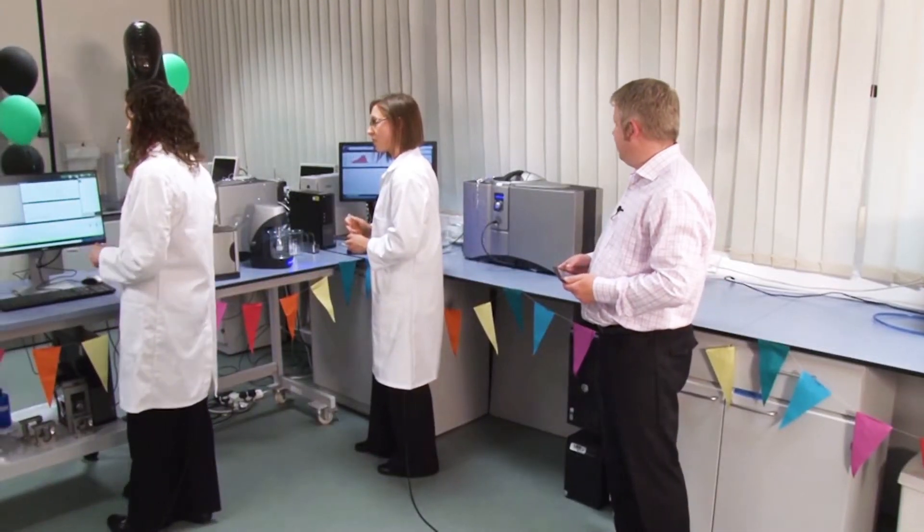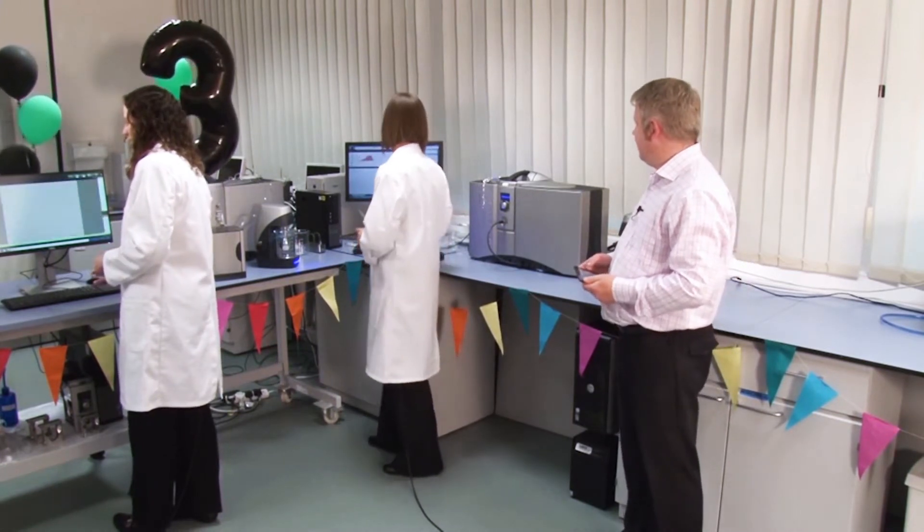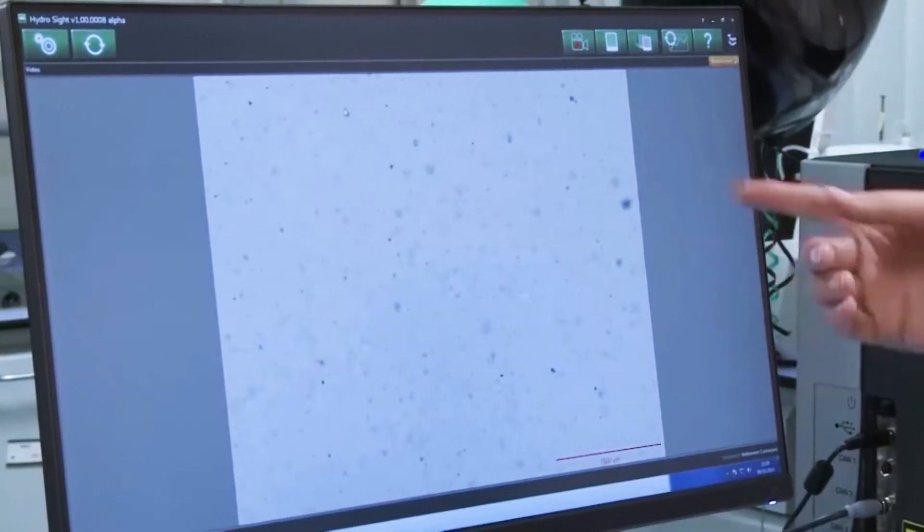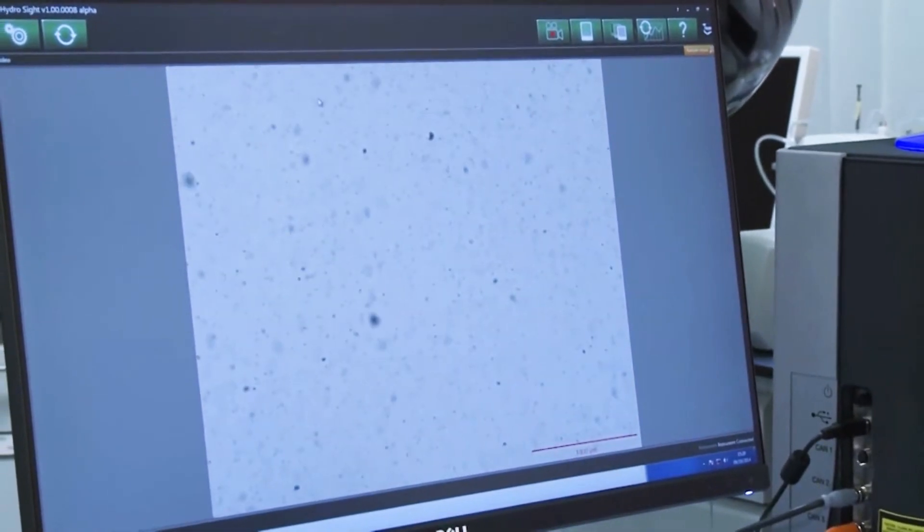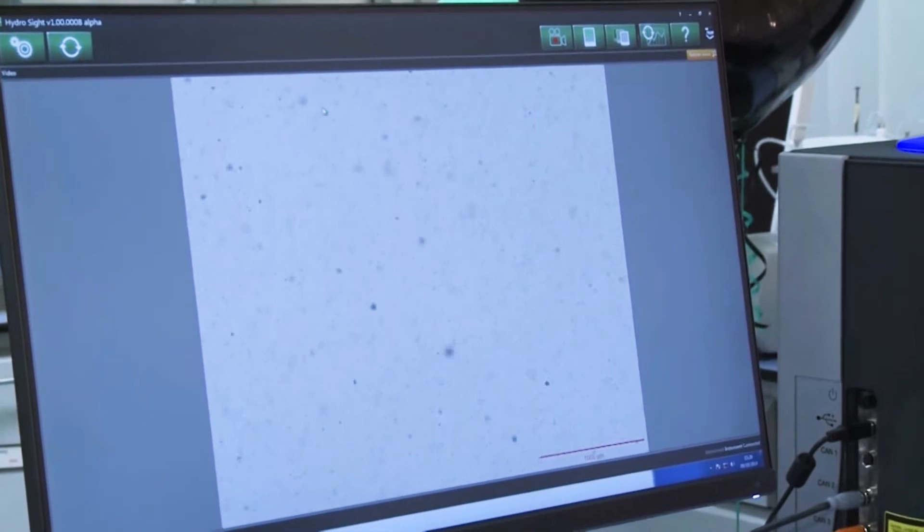Okay, so yeah, over here on the HydraSight software we've got a few different views. And first of all, we're going to have a look at the live video view, and indeed we can see the odd really large lump as well as lots of very fine particles. So that's a good indication that we've got some agglomerates.